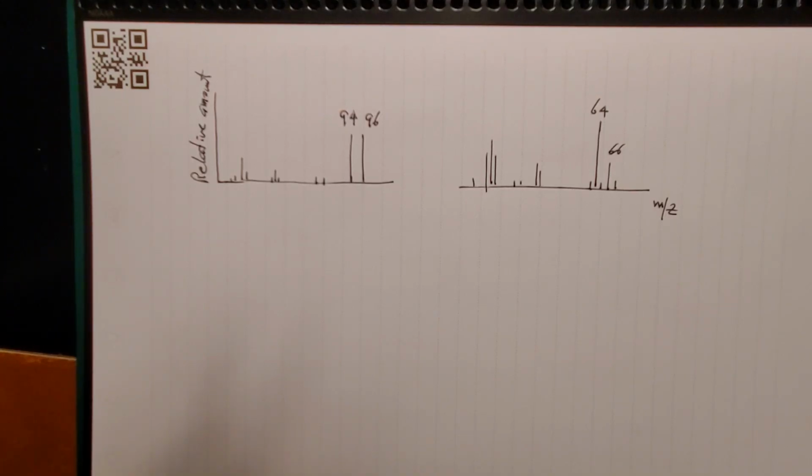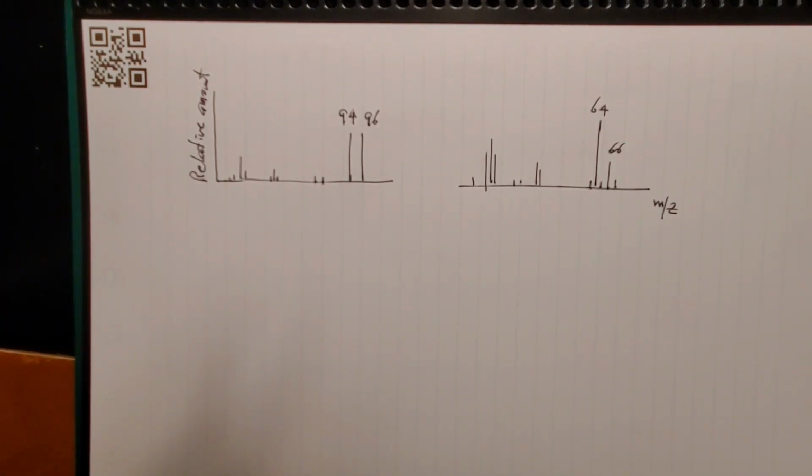Now you have 2 compounds. The question is simple. You ran some reaction, like a halogenation, and which spectrum is your product when you did chlorination?